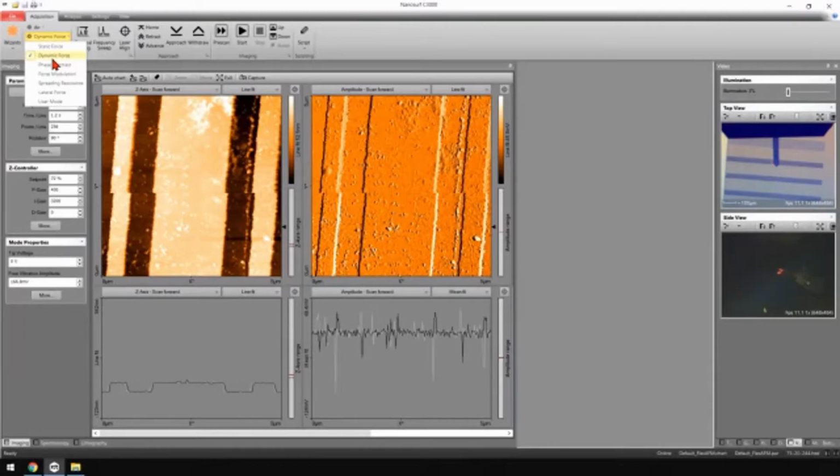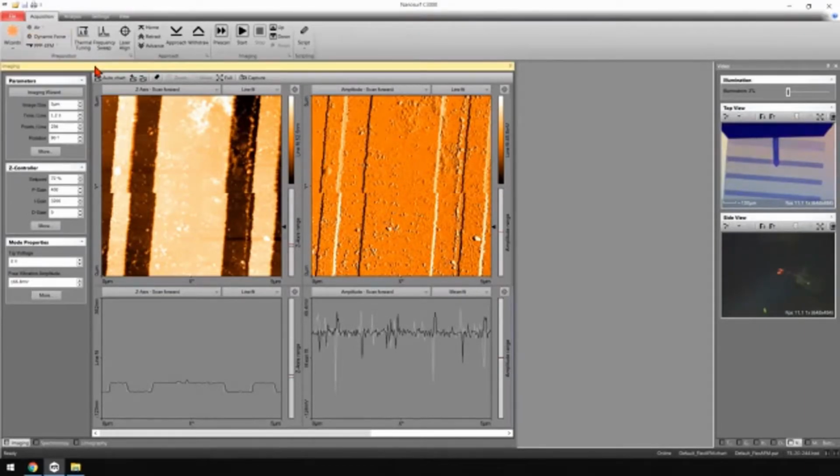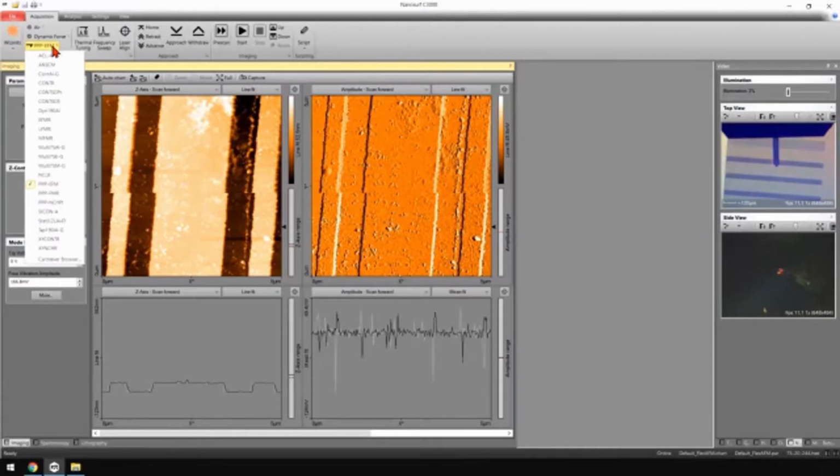It is also mostly known as tapping mode because you are in ambient condition. In vacuum, you would rather use some frequency modulation scheme or non-contact AFM. And because we want to be sensitive to the electrostatic force, you are using an EFM cantilever and a nicely conductive coated tip.